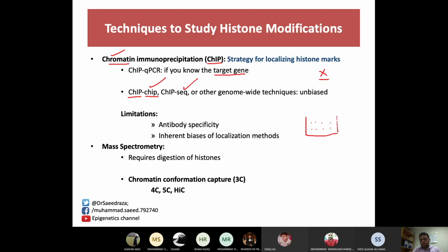If I make a chip for you, it could be possible that by the end of the day, after overlaying this extract, you could highlight this fraction. You could have fluorescence on this area. So this will tell you that your chromatin extract contains these genes, which could be identified through this technique. So by the end, you could identify genome-wide loci which are present in your chromatin extract.